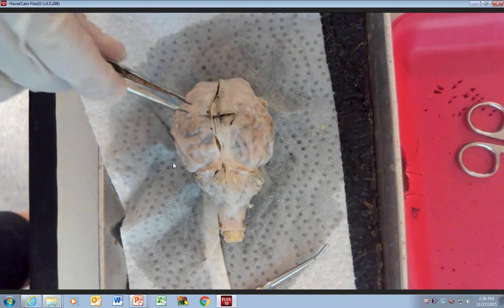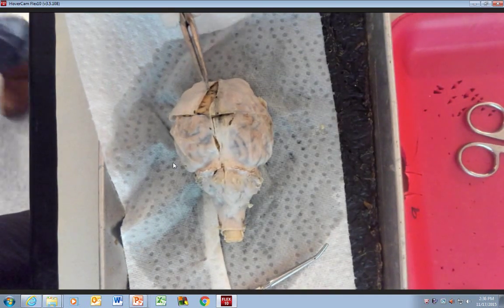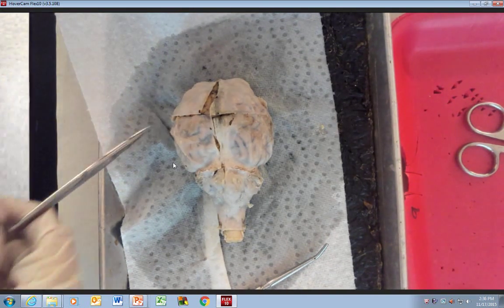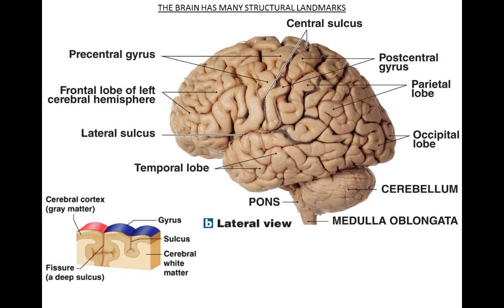So we have a brain. This is a sheep brain and they have been working on removing the dura mater so we can see all the different hemispheres and the landmarks of the brain. We're going to take the dura mater off here so we can see things like the central gyrus. The gyrus is the part that is elevated, and the sulcus is the deeper parts.